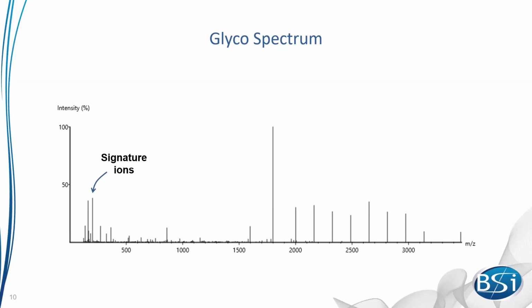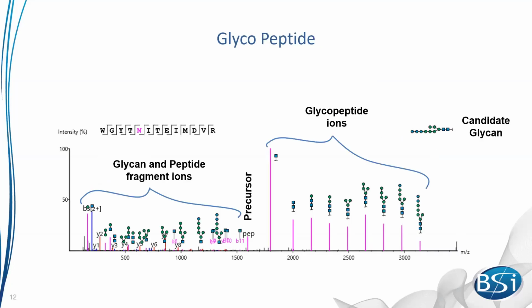of high intensity peaks over there. Those are the glycopeptide peaks. Basically, they give us some ideas about glycan candidates. So from this information, along with the precursor, we can come up with a candidate list for glycans. And from then we look at the lower mass region and find those peptide fragment ions and the glycan fragment ions to find the peptides.